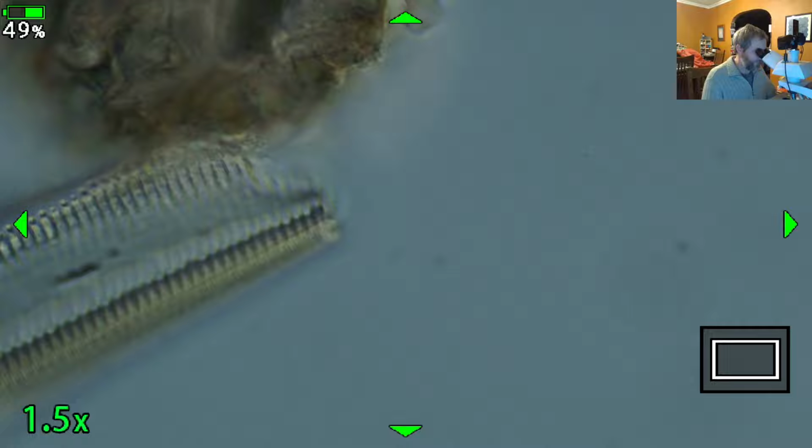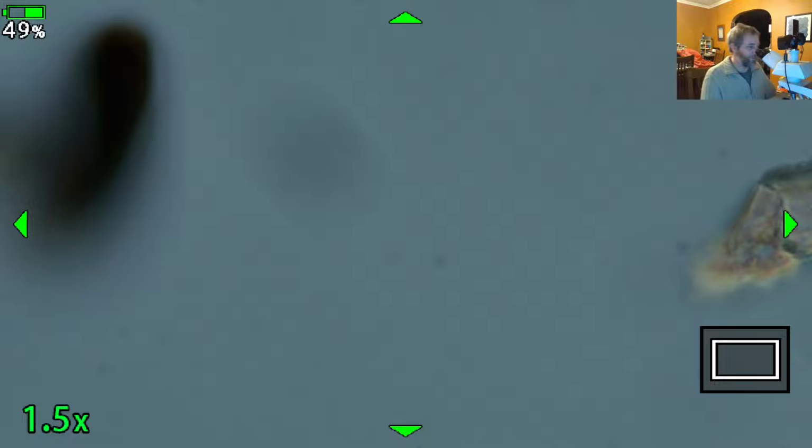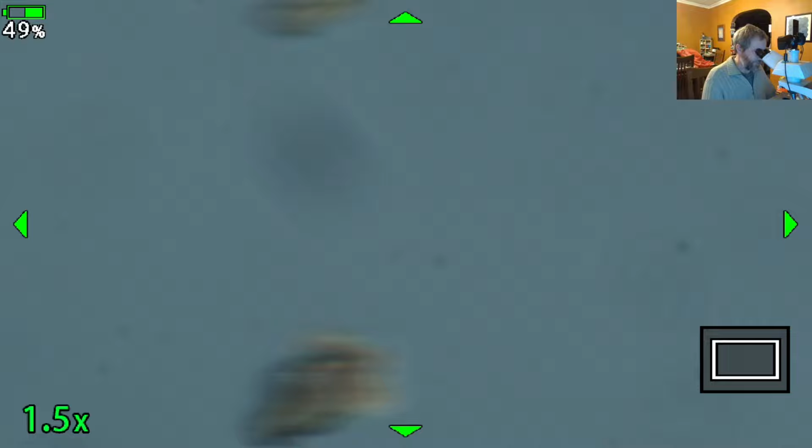And there's another one of these. That one is the Gomphonema. That's the other monster, but just a fragment of it. But diatoms can actually crawl around and reposition themselves. And so if I had a live sample, which I don't have any in my house at the moment, you would be able to see them crawling, especially because once they get on the light microscope, the light from the objective heats up the water a little bit and also provides them with some light so they start to activate.